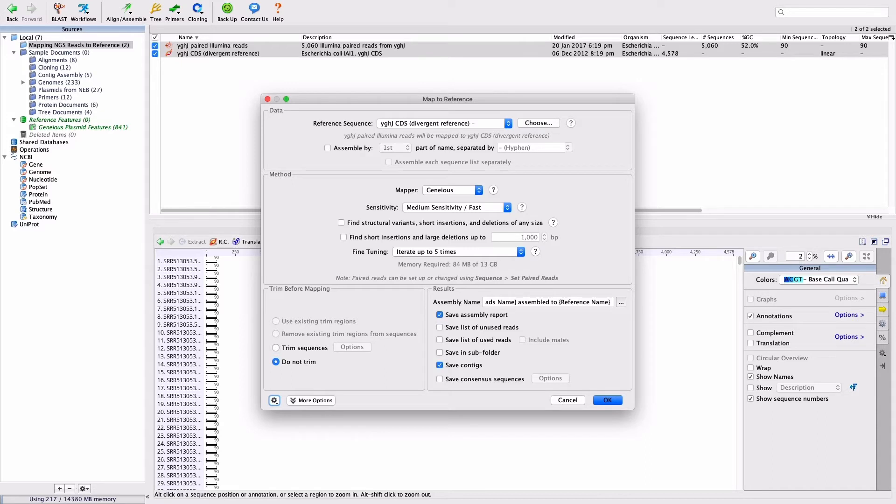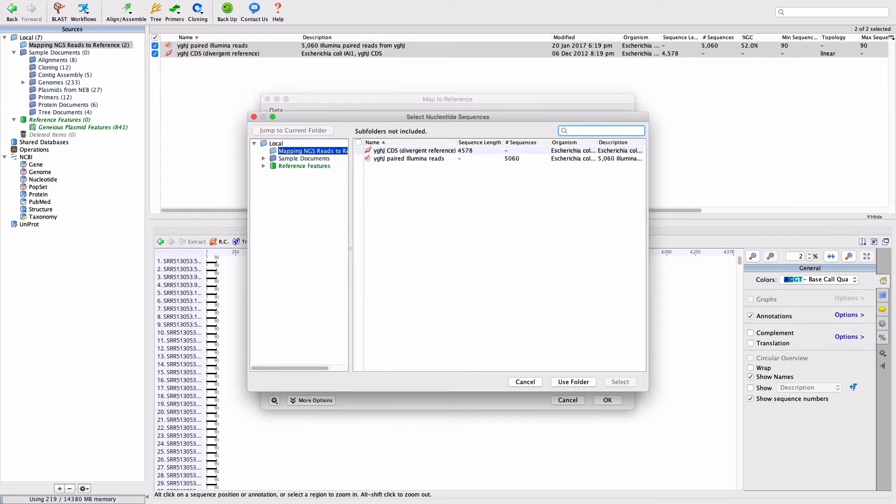Note that the reference sequence does not have to be pre-selected before opening the mapped reference window. Instead, it can be selected from any folder in your database by clicking the Choose button within the Setup options. This option will also allow you to select multiple reference sequences, or sequences from another folder.